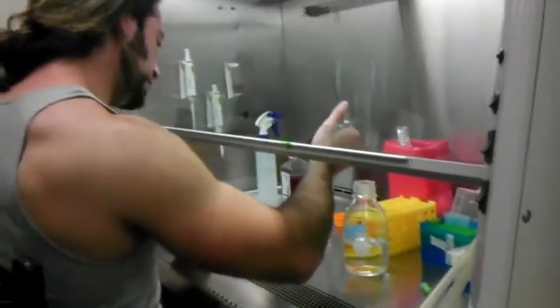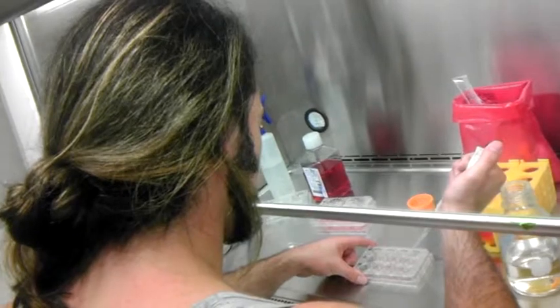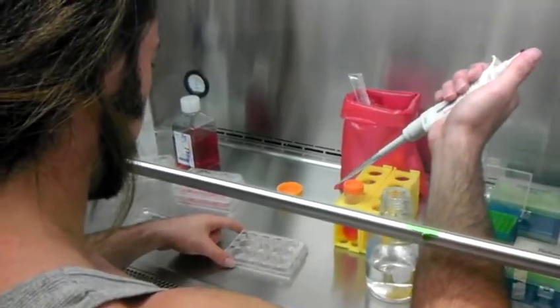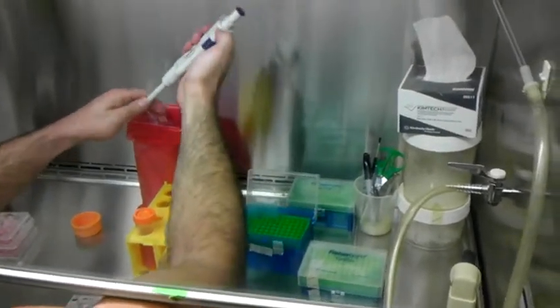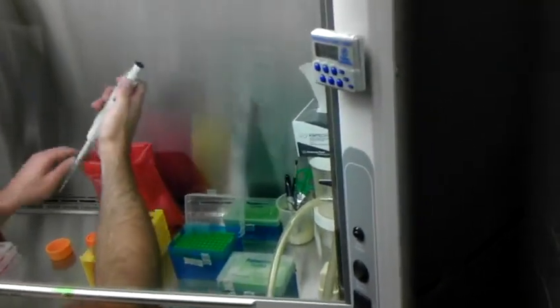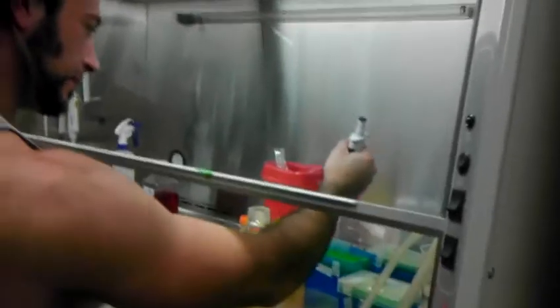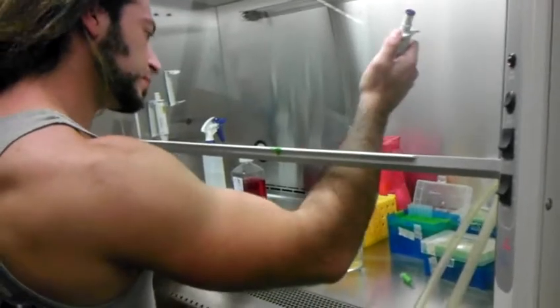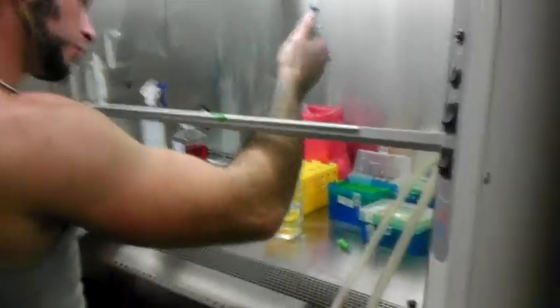You want to spray it on the wall, right? Yeah, hit the wall. I always hit the left side of the wall, that way you don't actually have to lift the plate up. And don't touch the wall itself, because you're going back into the PBS. Yeah, I already did. These tips are not easy to get off at all, are they? No, they're not. They get stuck. Alright, so we don't touch the wall.